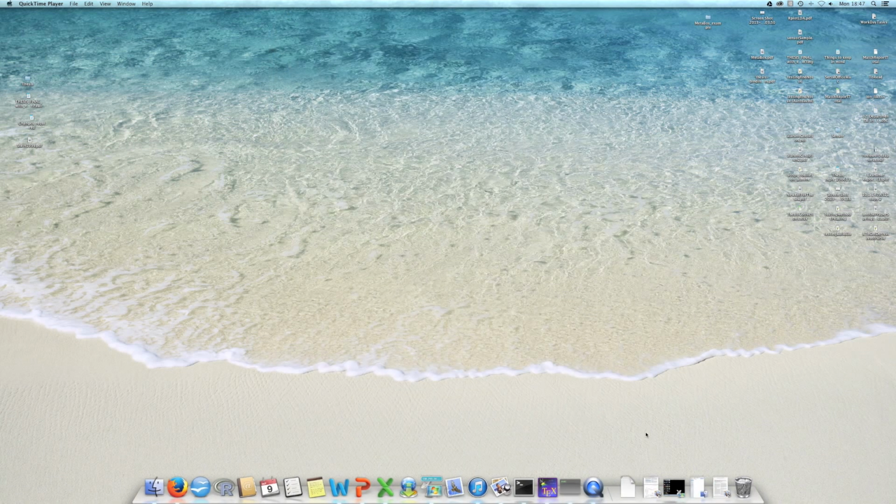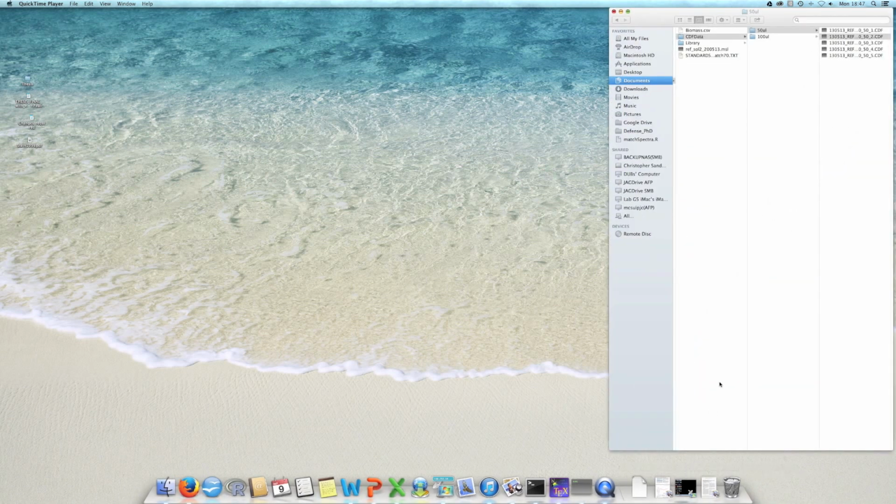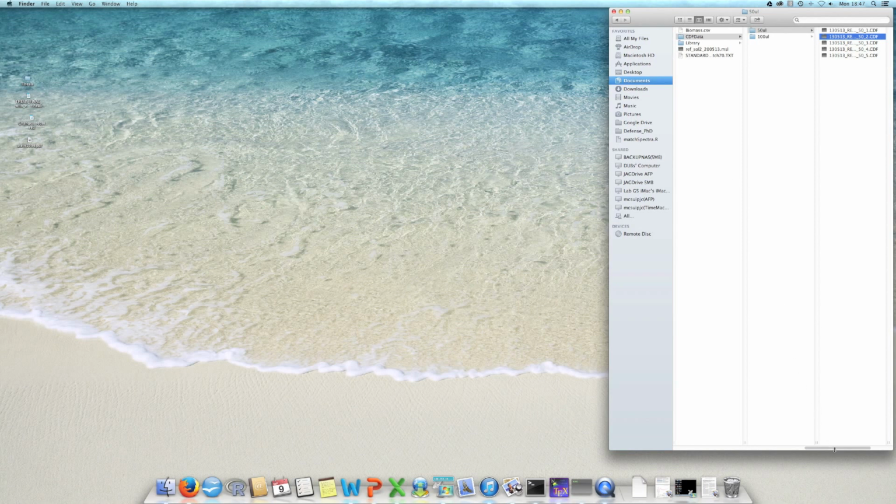So the first thing to do, I think, is to install the package itself, because the package has plenty of help files and tutorials, so you can actually use the information in the package to know better how to use Metab. So I'll give you some examples.